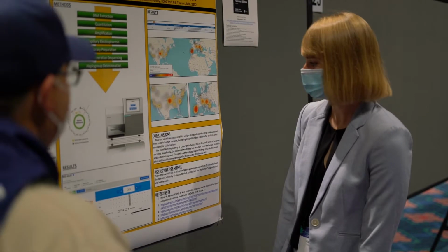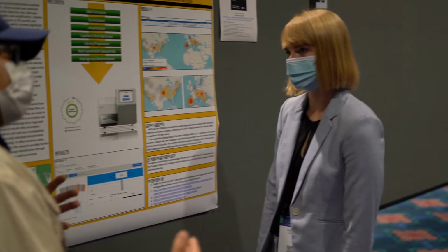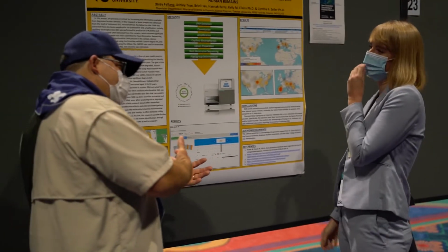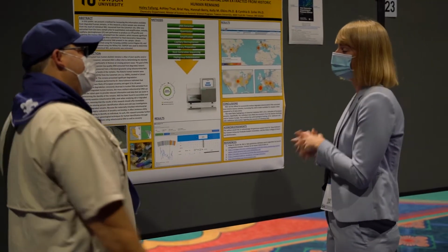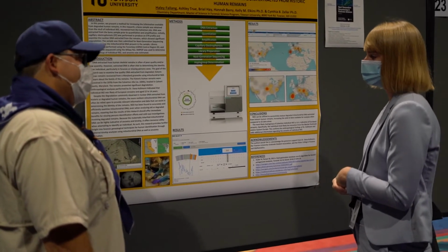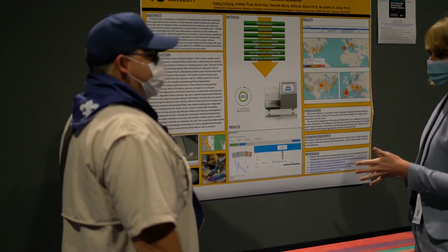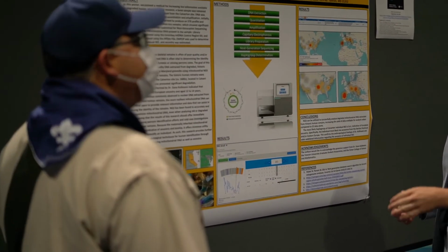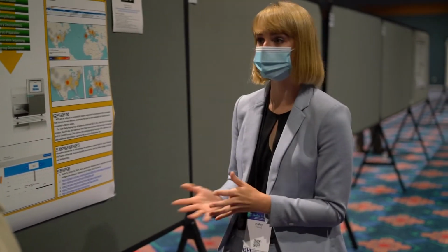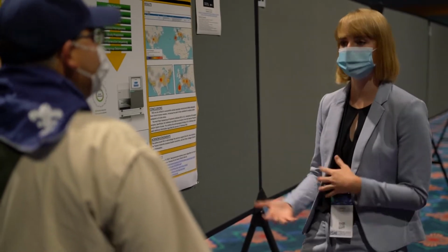That is a fantastic study. So tell me about that mitochondrial DNA. The powerhouse of your cell sticks around longest, and so you get the best DNA from that? Yeah, so it's really awesome. It is much more resilient than our nuclear DNA, of course. So that's why we focused on it, because we figured that's going to be probably there. We did do CE, and it was terrible. There was no peaks, really. It was not a good sample. So that's why we tried Mito, and especially next generation sequencing, because you just get so much more information.